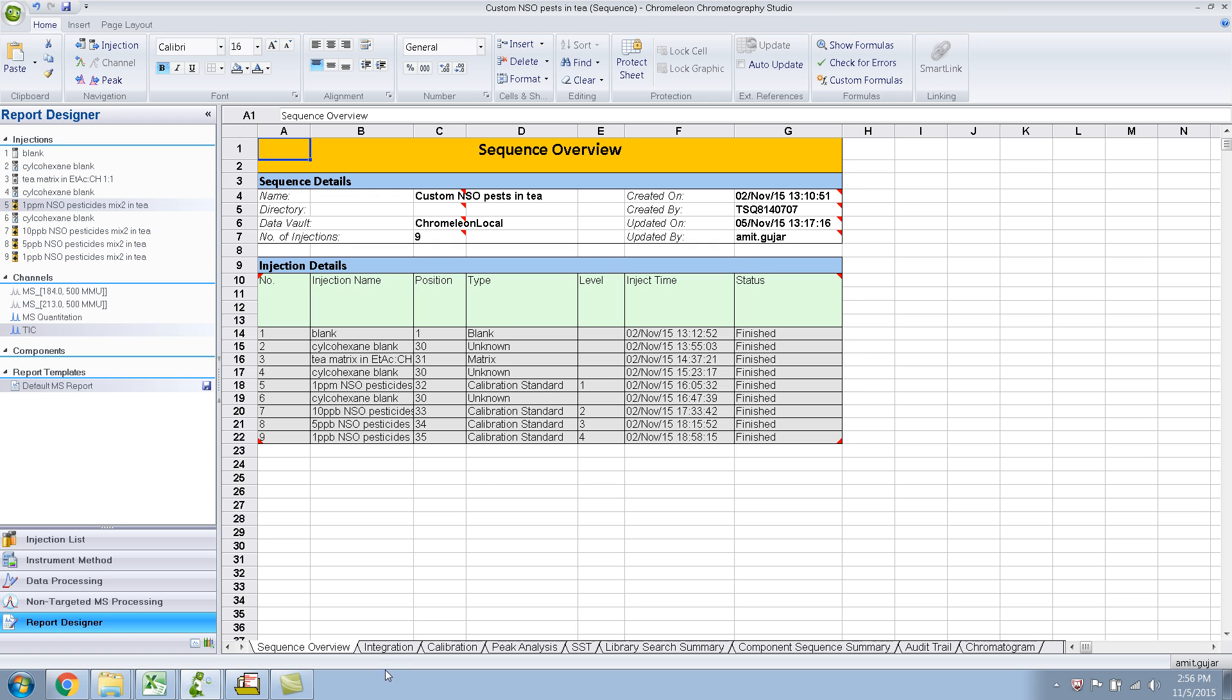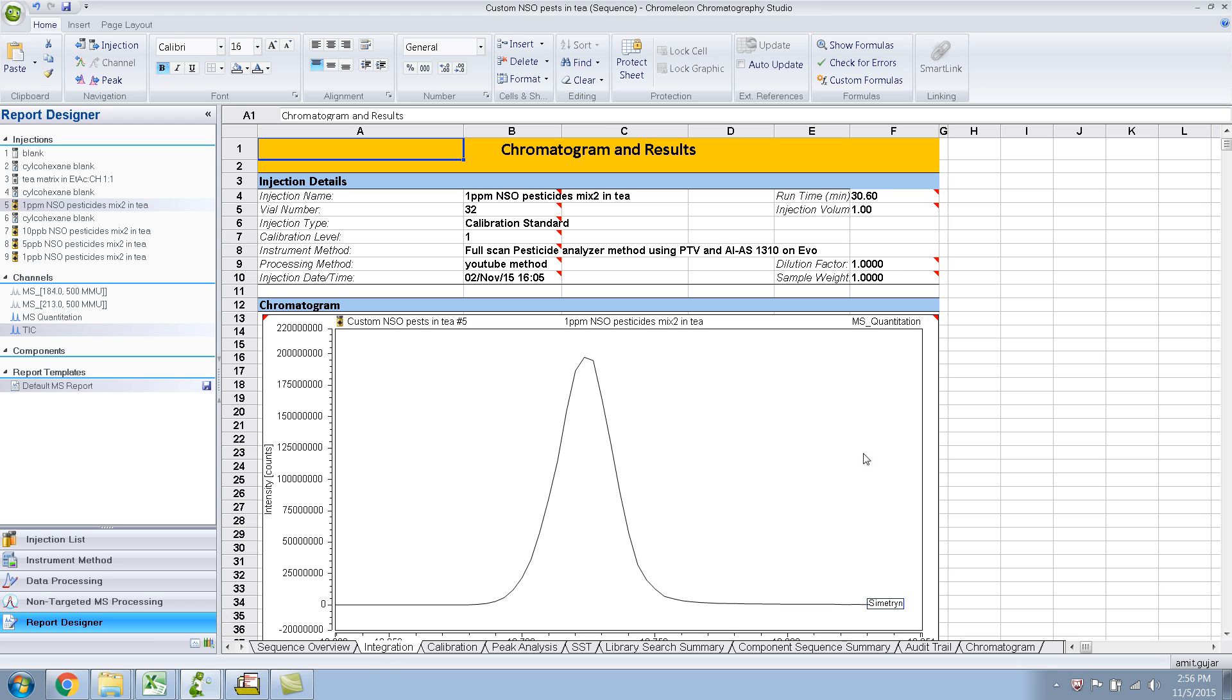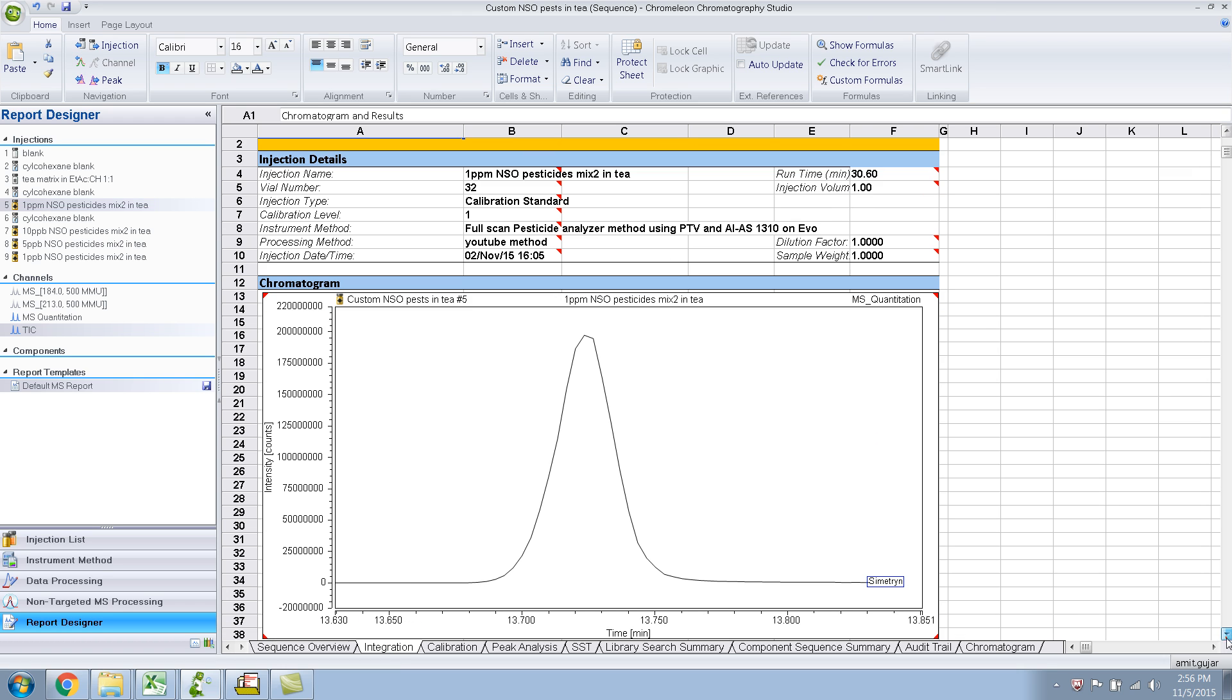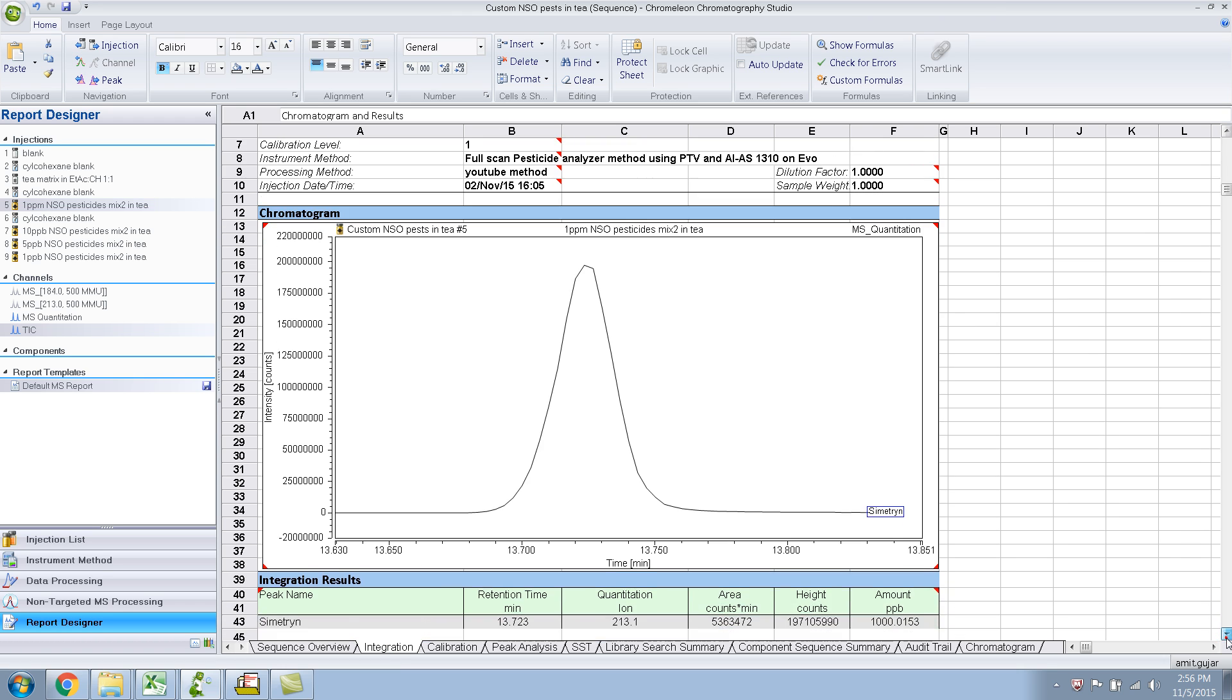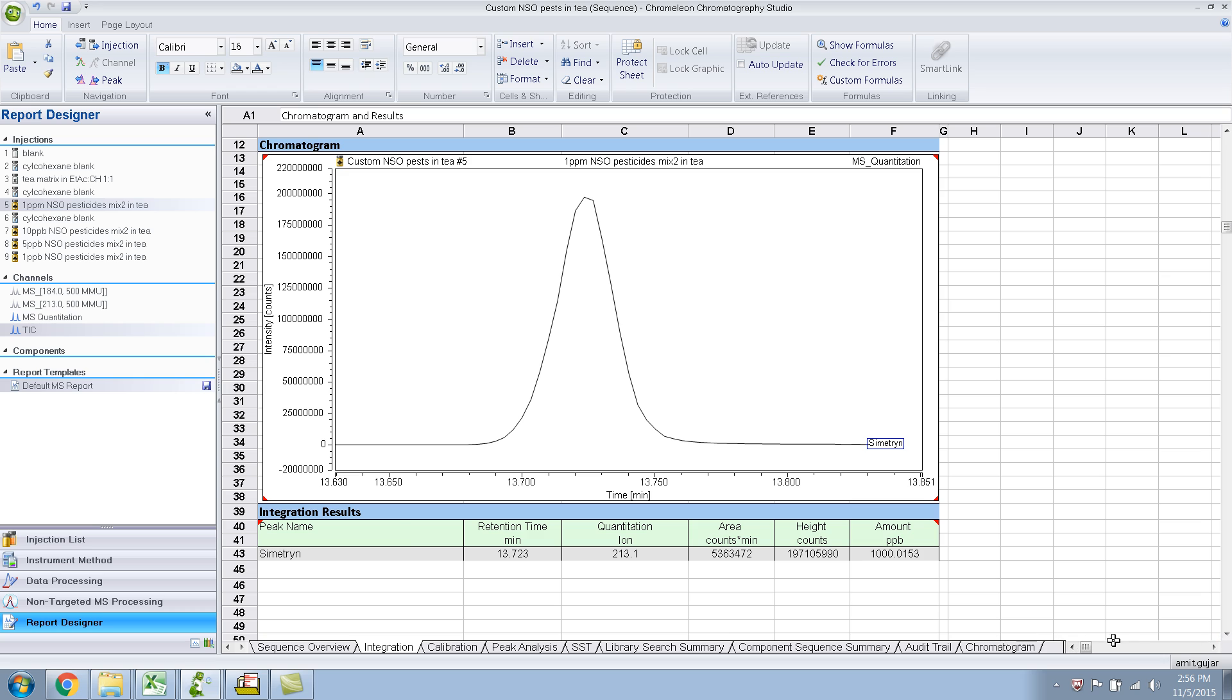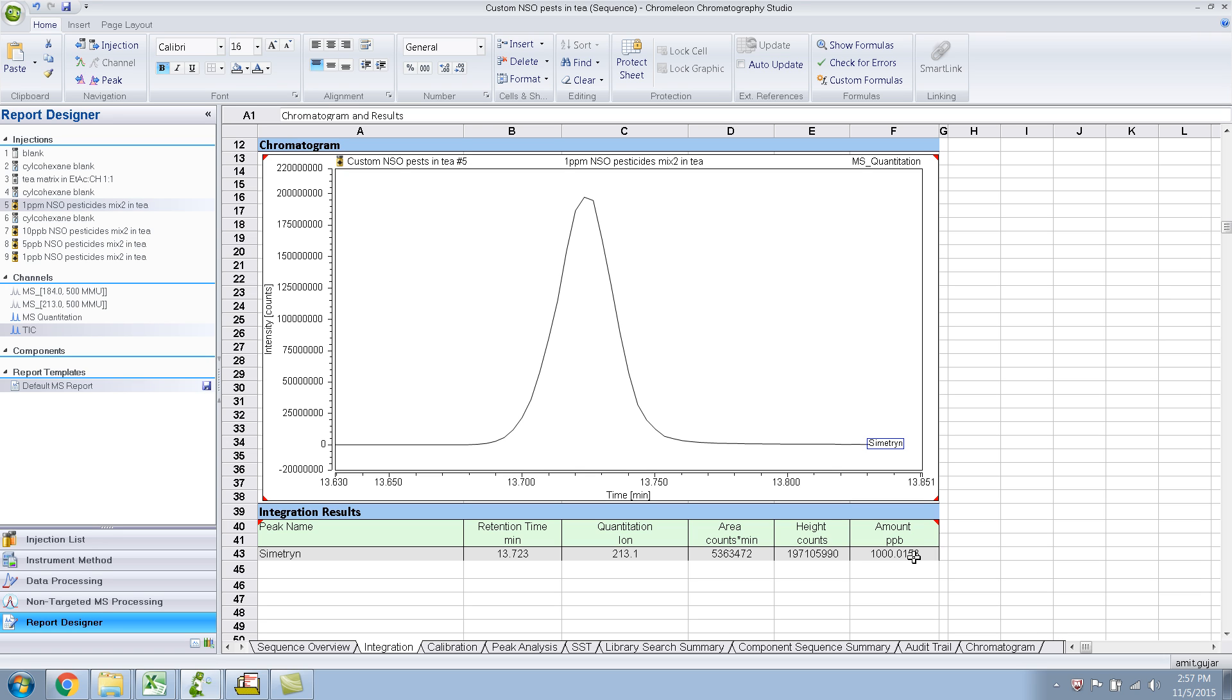The second tab is integration, so it gives you the integration report. For example, for Cimetrin, we had an area of like 500,000 something or 5 million meters for 213 quantitation peak. And also the amount, so this is the calculated amount from the calibration plot. So this is like 1000 PPB, which is like 1 PPM, right? So it's correct.